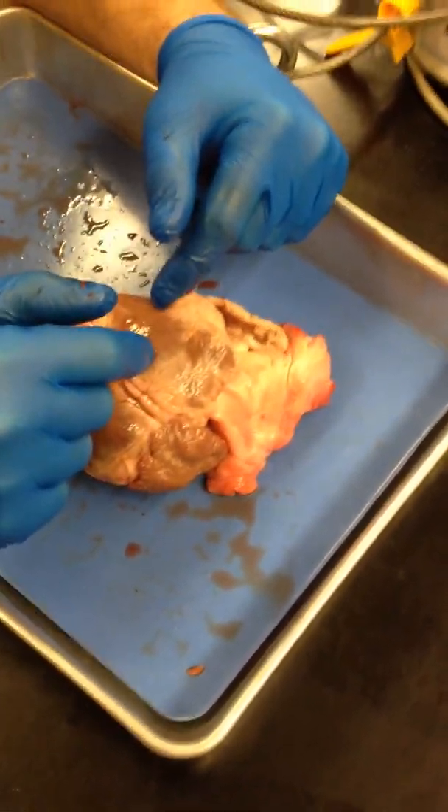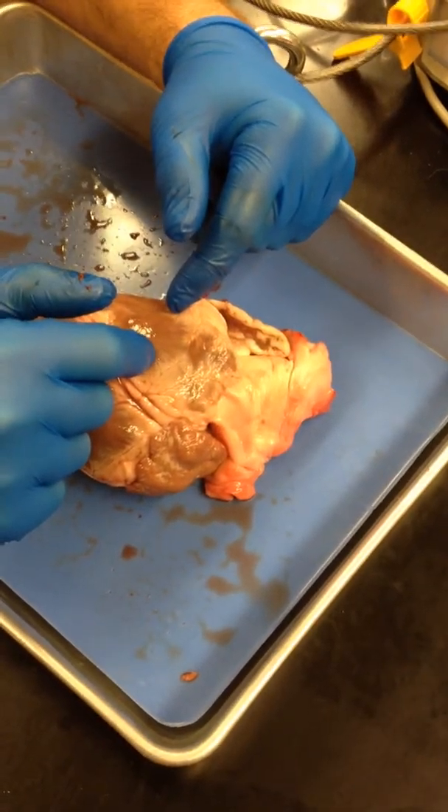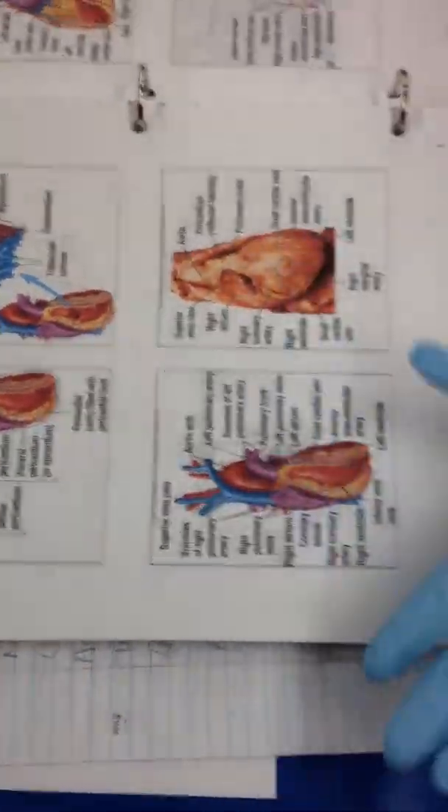Let's start from the beginning. What's our mediastinum? Mediastinum. Something to do with the middle. What side? Mediastinum.